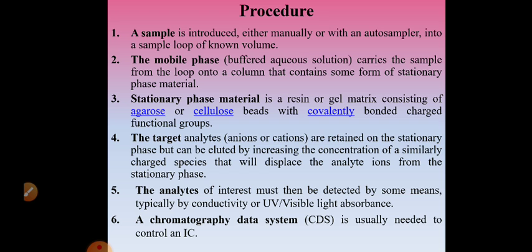Cation exchangers have positively charged counter ions which are electrostatically bound to the negatively charged functional group. Anion exchangers have negatively charged counter ions which are electrostatically bound to the positive functional group. Depending upon what molecule you are separating, you will use either polystyrene or cellulose based resins. Cellulose based resins, generally Sepharose or Sephadex, or CMC, carboxymethyl cellulose, are used for separating large molecules. Polystyrene is used for separating small molecular weight compounds.